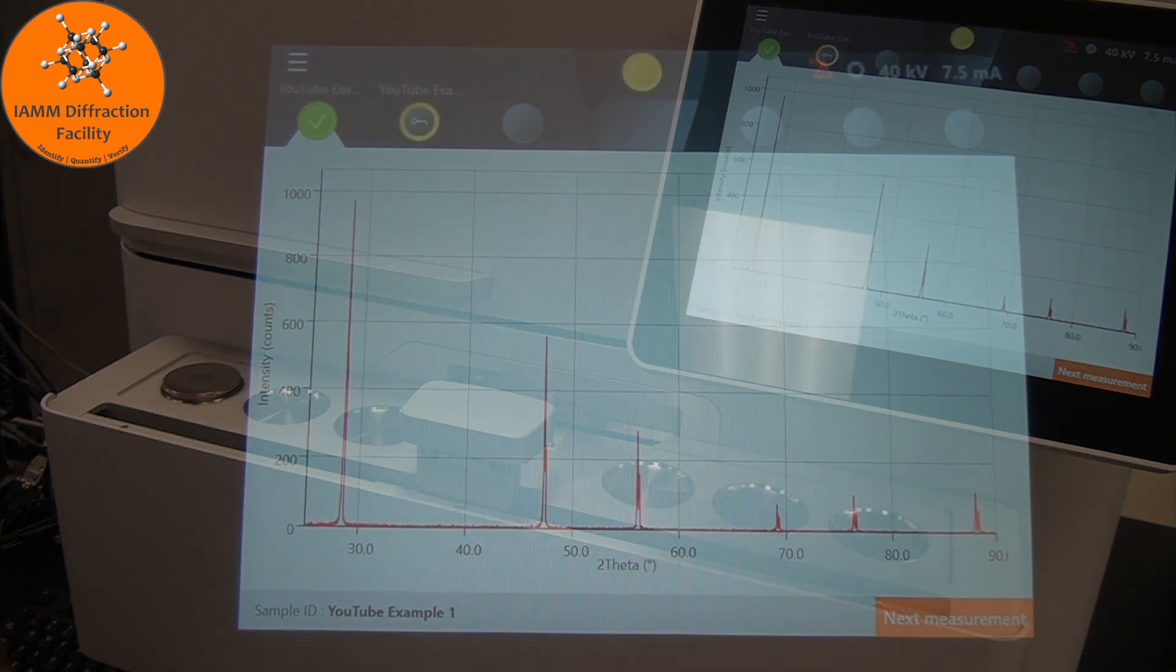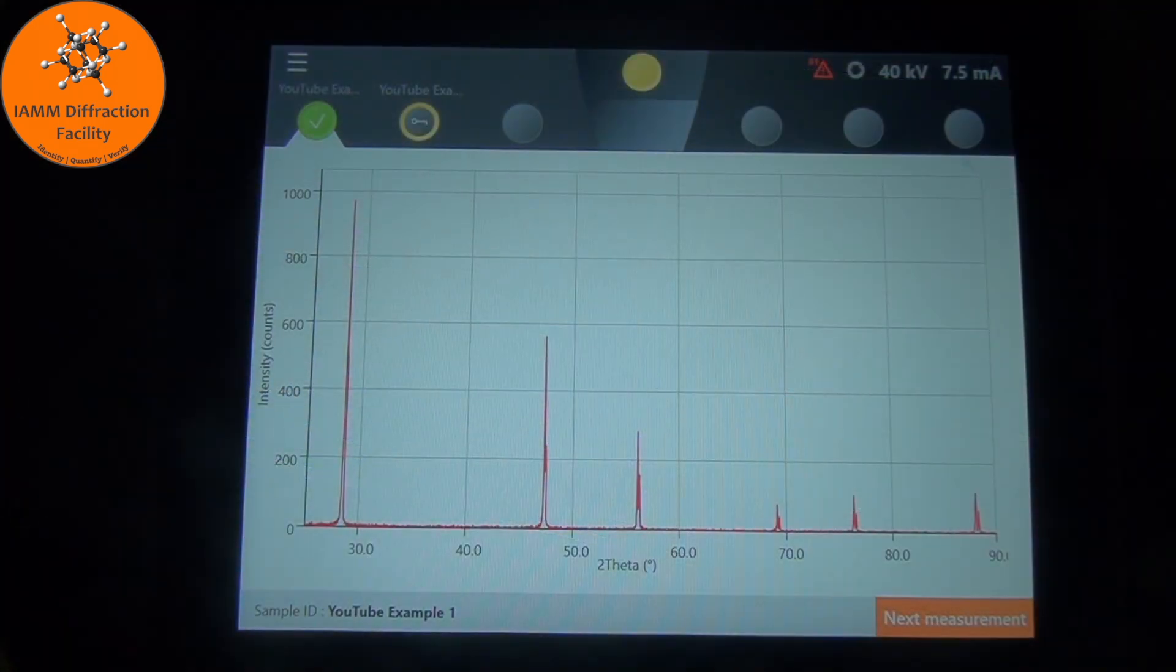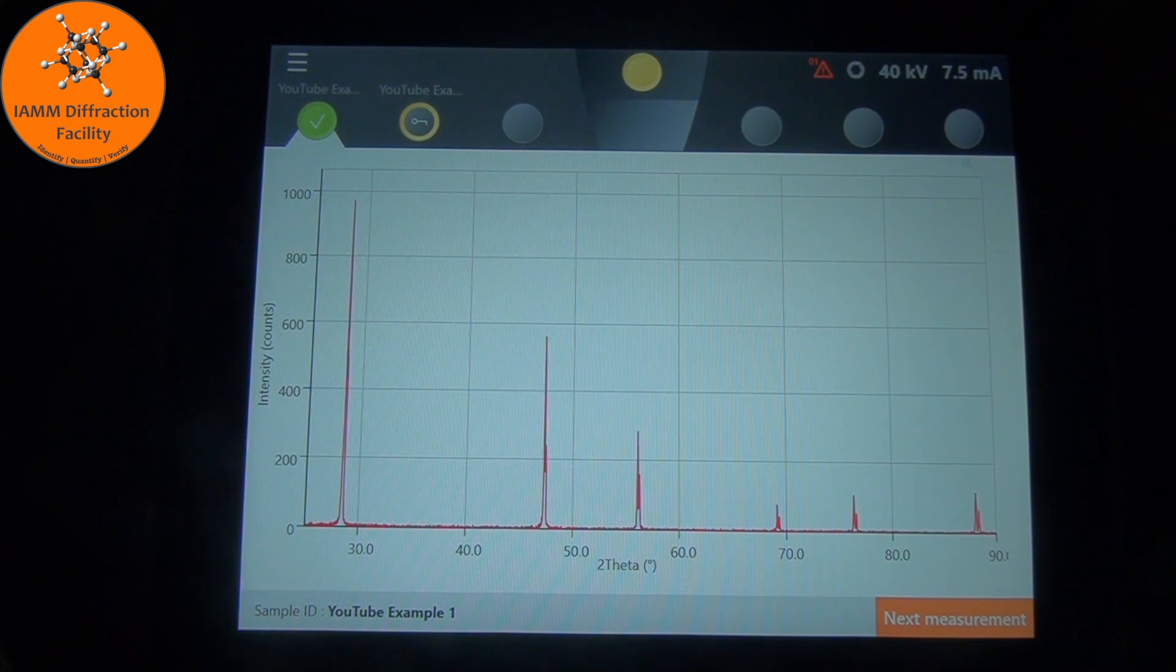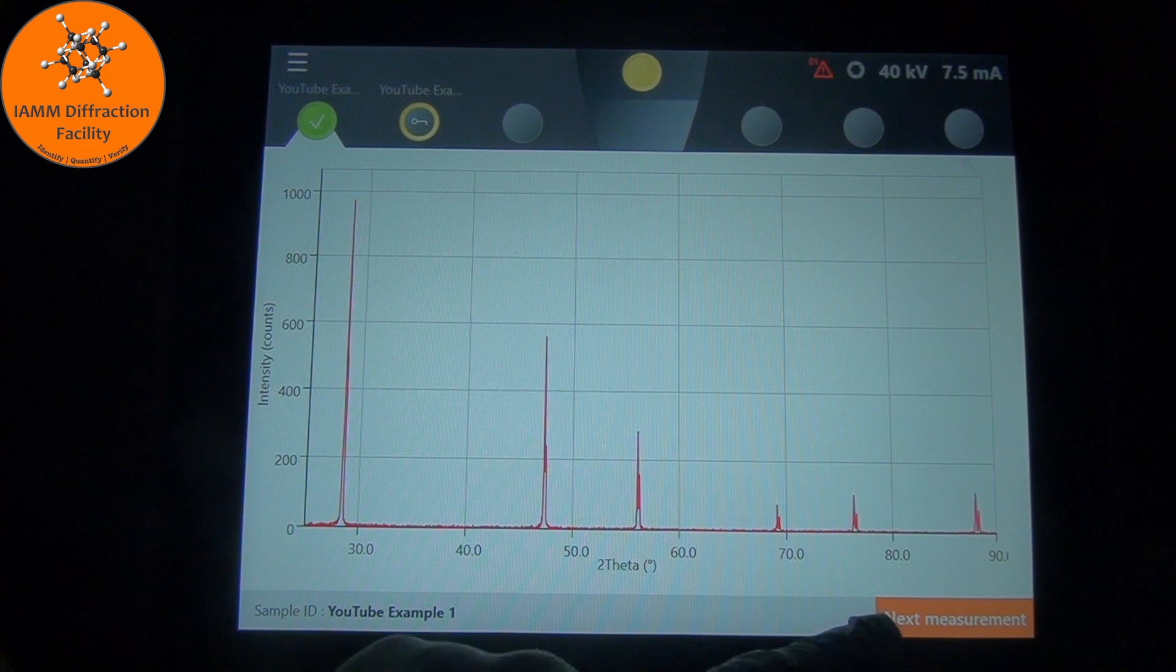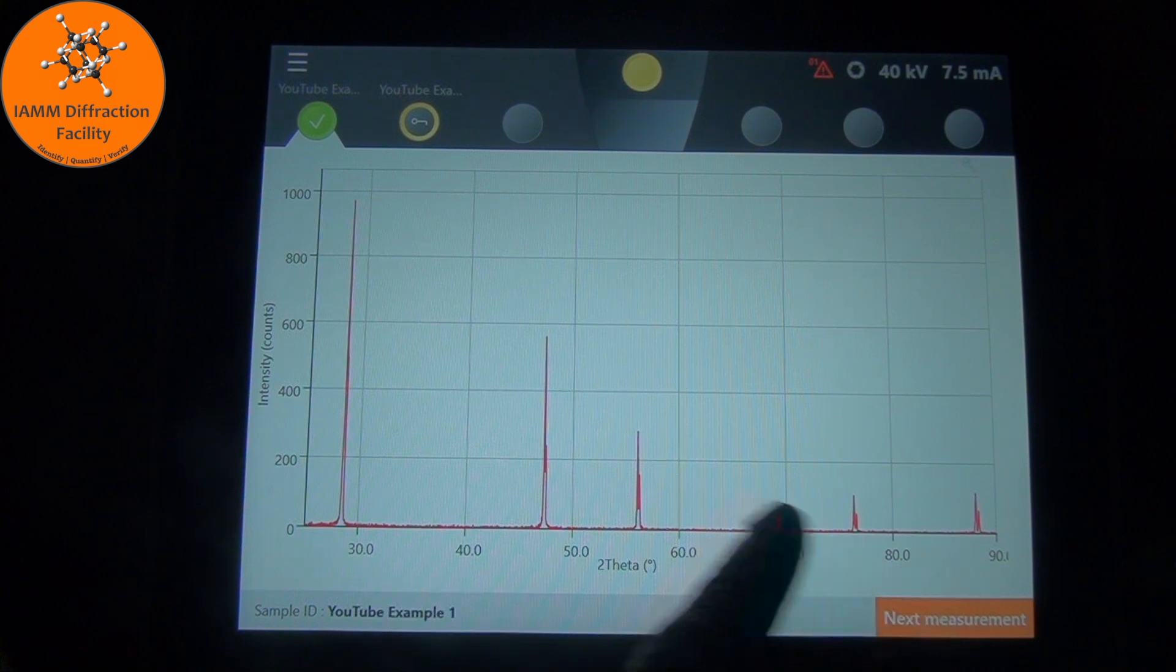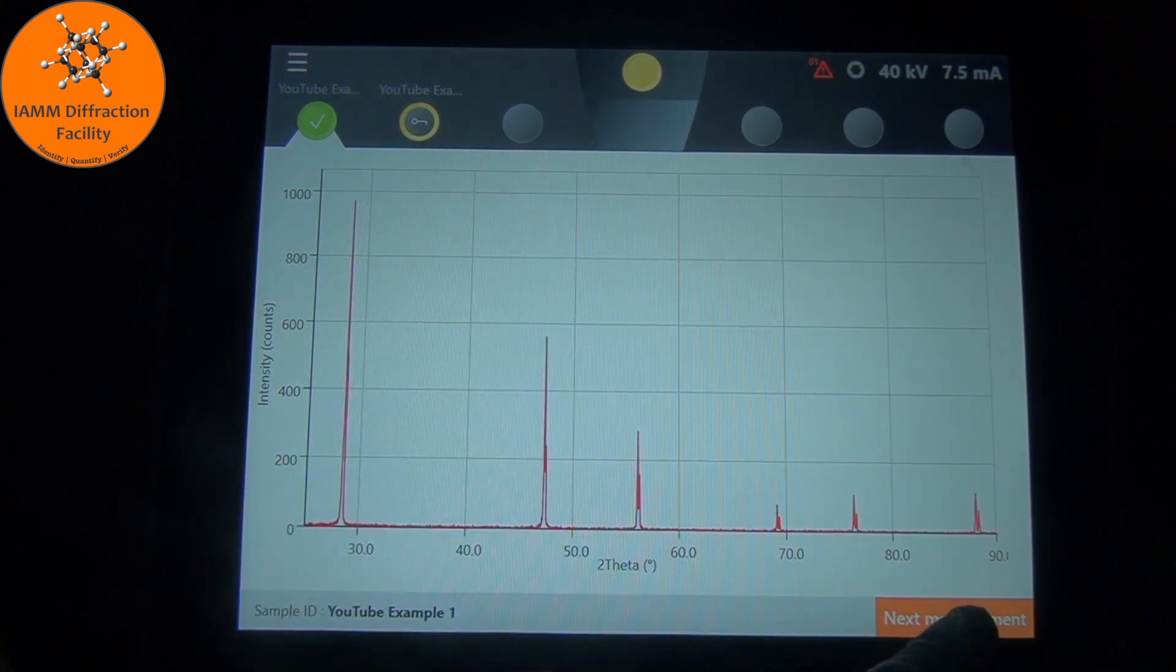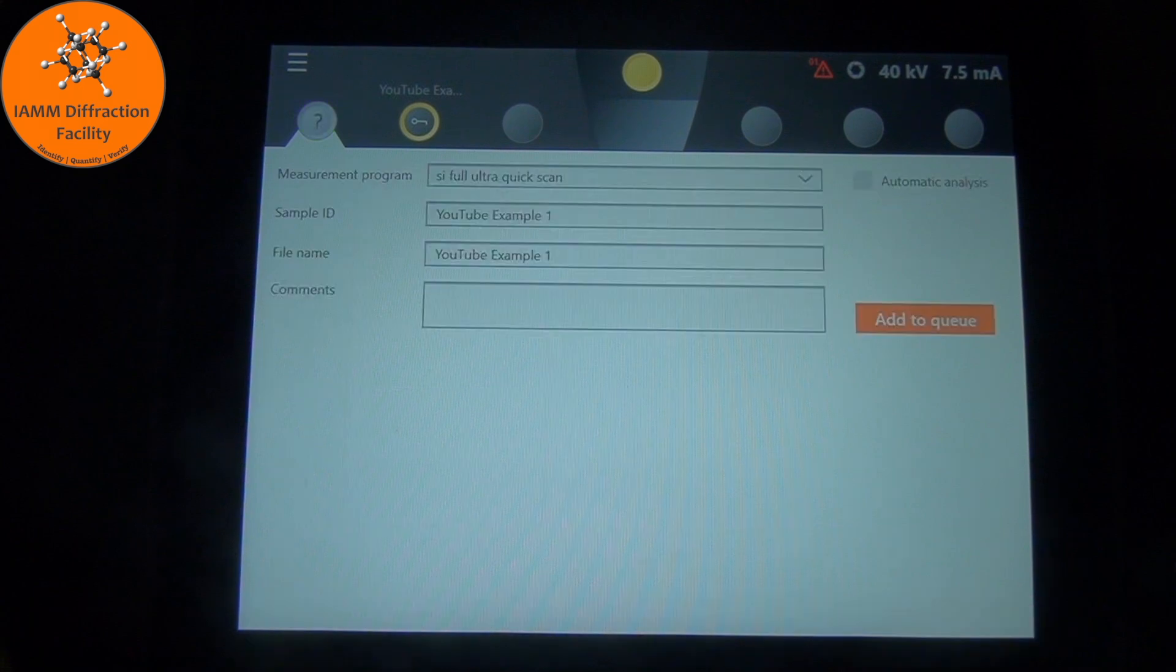We are still on the screen for the first sample. We see the diffraction pattern. Whenever your sample finishes collecting, I ask that you click this next measurement button down here on the bottom right. That clears this out and gets it set up for the next sample.